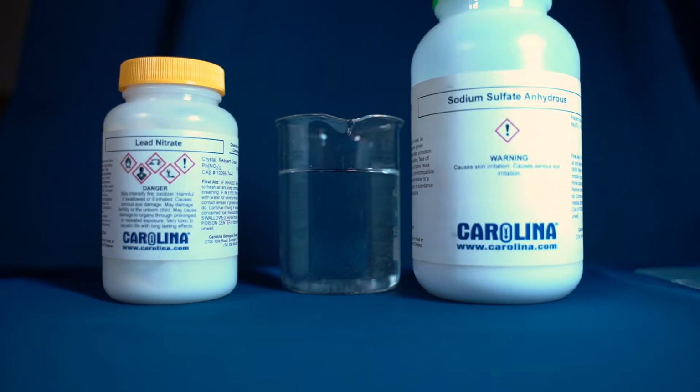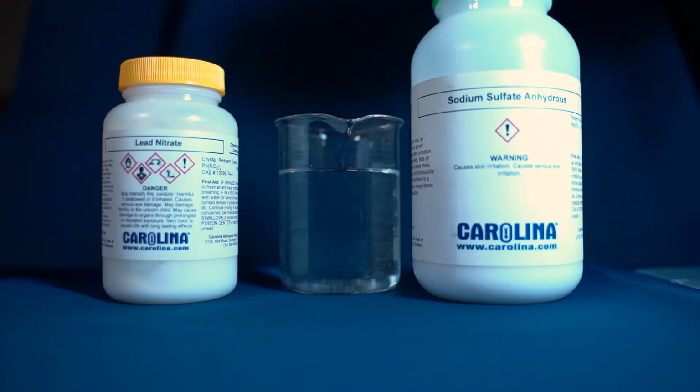Hi, I'm going to show you guys a precipitate reaction by combining two aqueous solutions to form a precipitate in the solution.